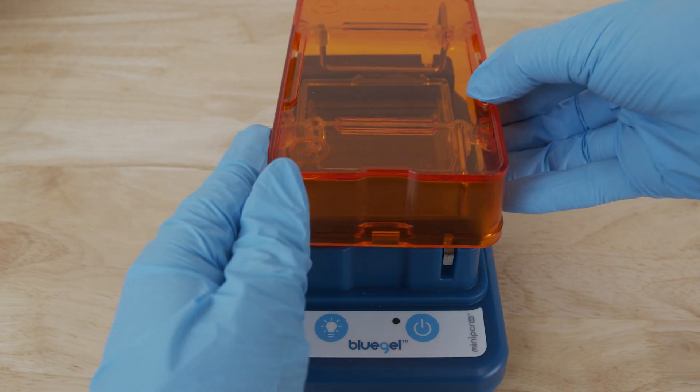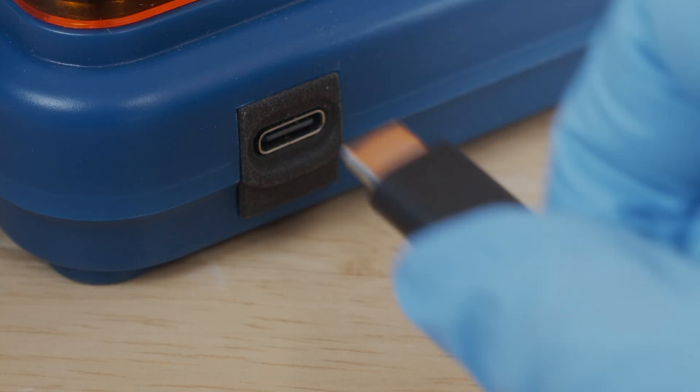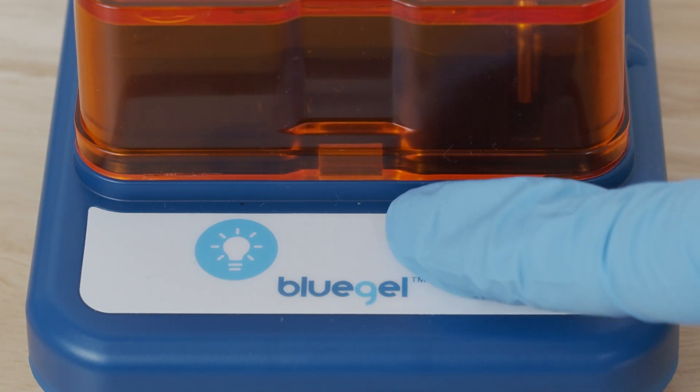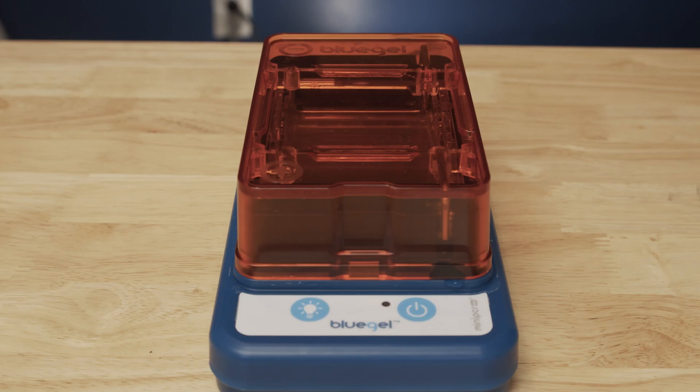To run a DNA gel, the system will only run with the cover closed. Place the orange cover on the blue base, connect to the provided power supply, and press the On button. A green light will indicate that the system is running. The Blue Gel System runs at a fixed voltage and can either be plugged into a standard outlet or run off of a portable battery.